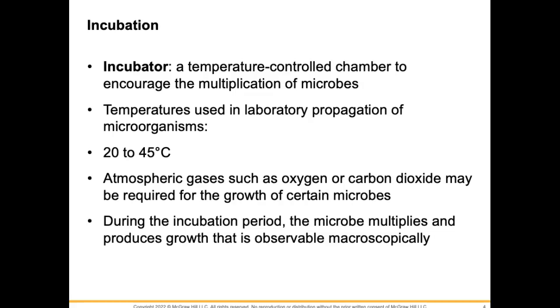So again, an incubator is a temperature controlled chamber, and that's how we incubate the specimens. And I said earlier, it's usually 37 degrees. I'd say 95 out of 100 specimens are incubated at 37 degrees, but occasionally we have to incubate things at a different temperature if we suspect it might be a certain type of microbe, because some microbes have a broader range of growth.